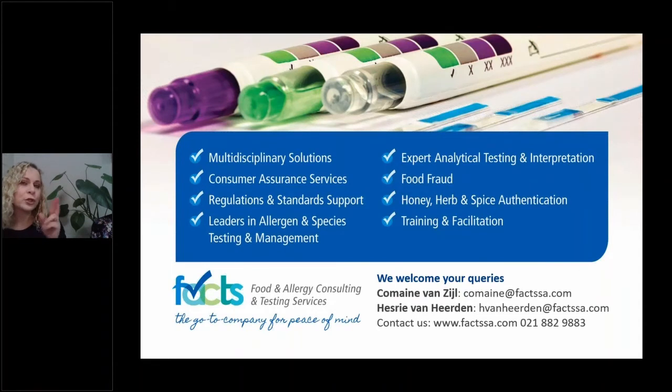Yes, but those two go hand in hand. So if you're going to use the rapid kit for actual product testing, then you still have to confirm that the kit will detect the allergen in the specific ranges that you want. Yeah, but I think what you're saying is very important, because there is a difference between approaching product testing and surface or cleaning testing. So very different.